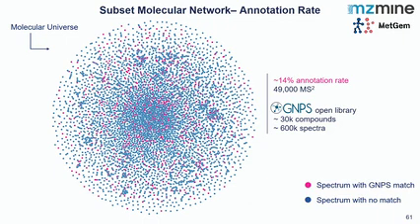And especially if we think about groups working on different topics, everyone has different subjects, different compounds of interest, so we can broaden up the public database if everyone would be willing to share the spectral data that they acquired and make it publicly available for any other researcher maybe working on the same topic.